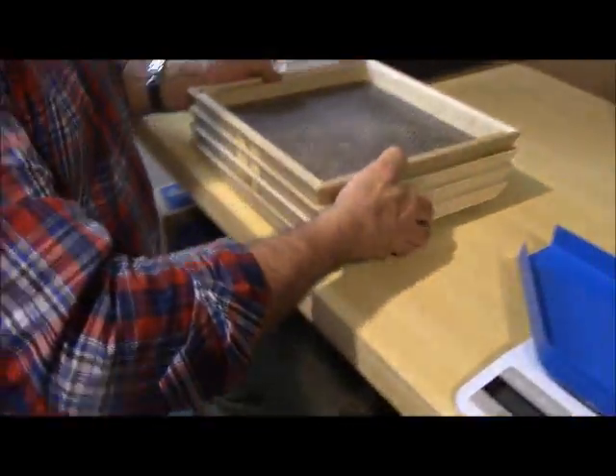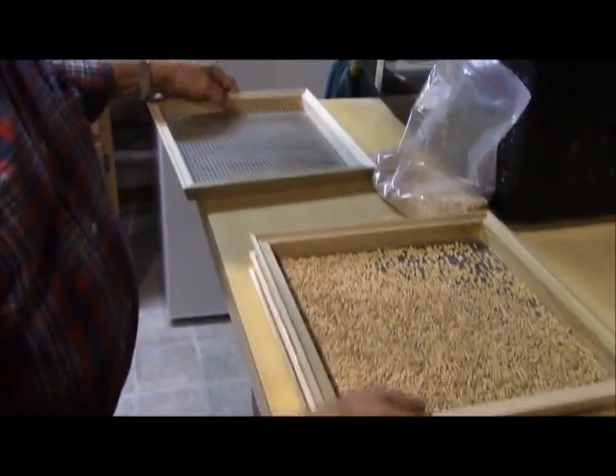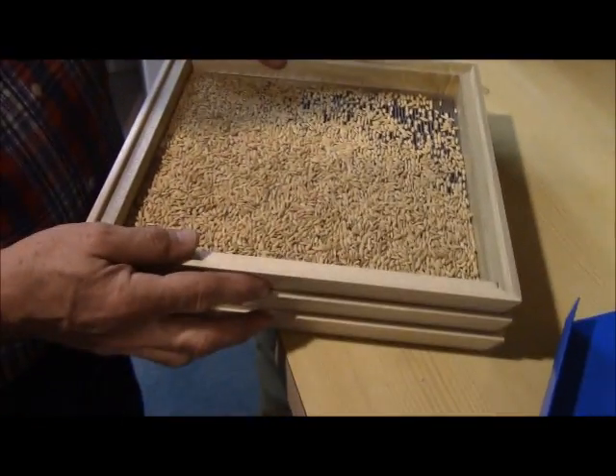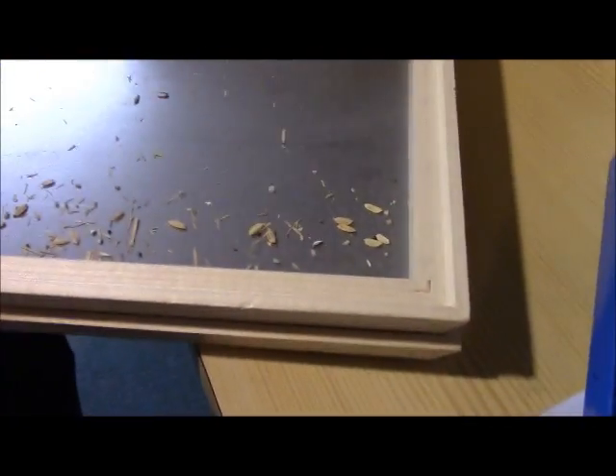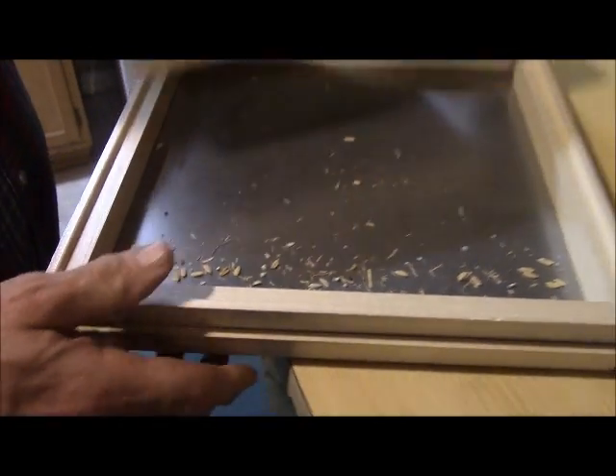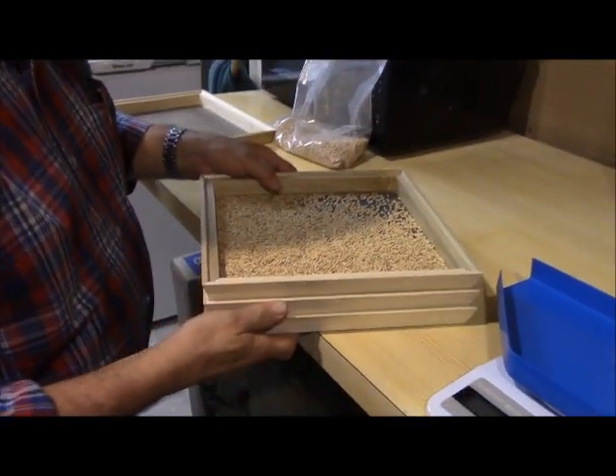As you can see, there is virtually no — very little — long waste in this product. From the paddy rice, this is the composition of the material. Very little, again, by percentage for what we have removed.